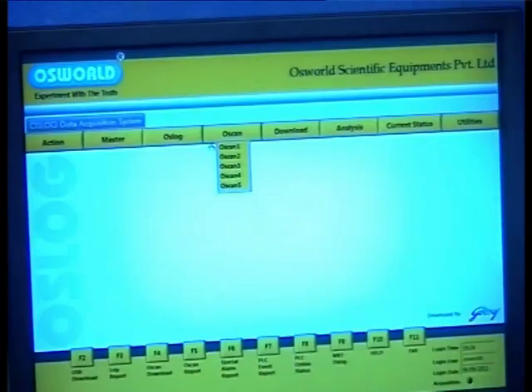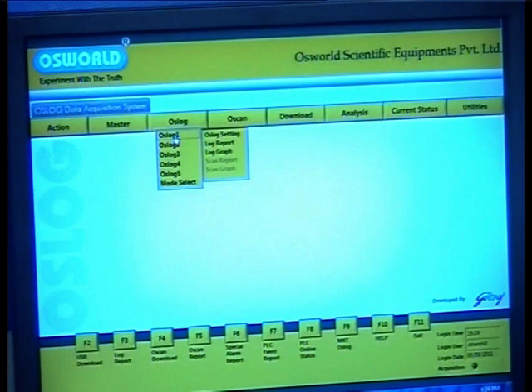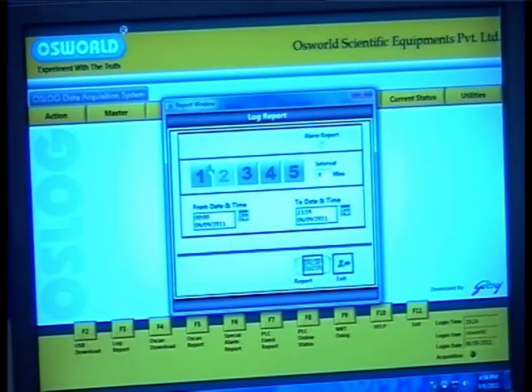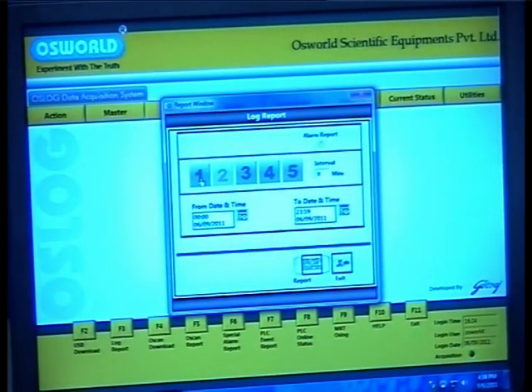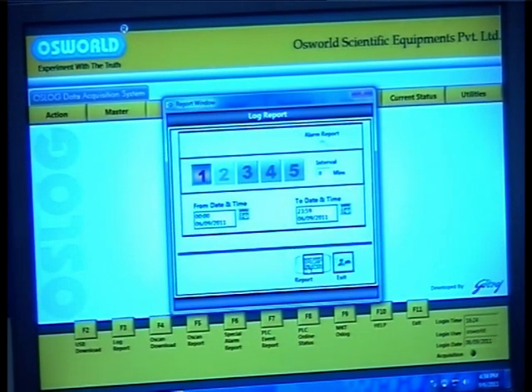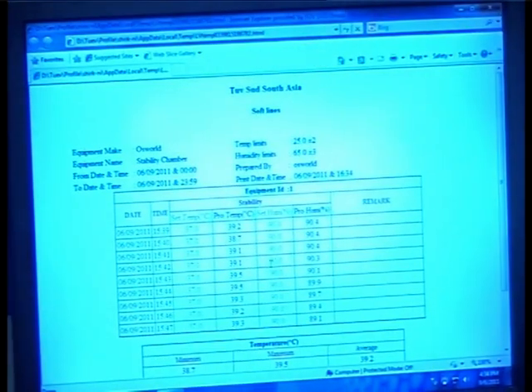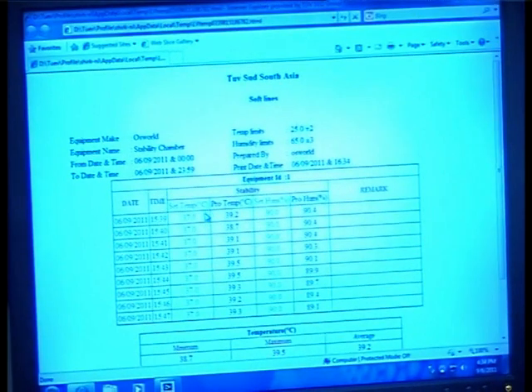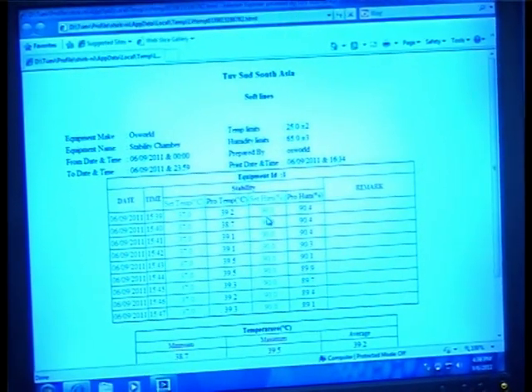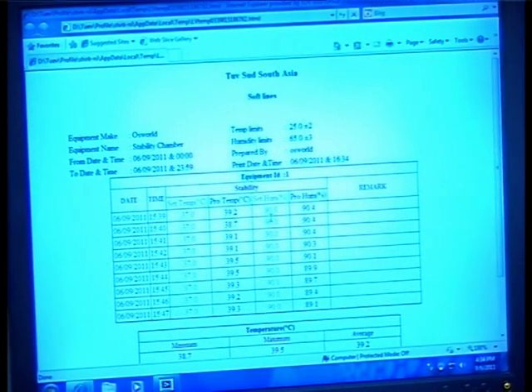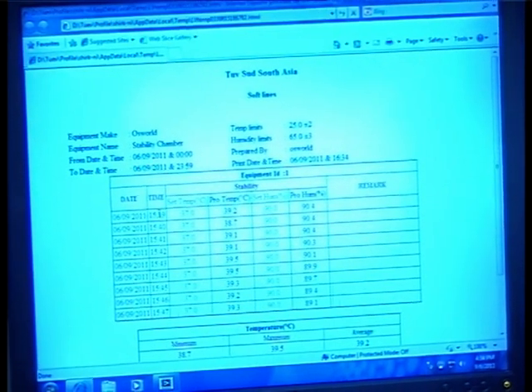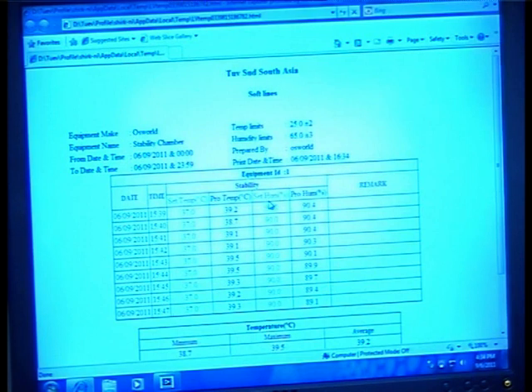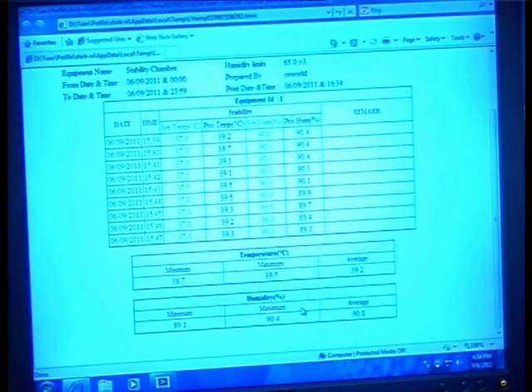Moving on to reports and graphs: data from your equipment can be recorded and viewed as numerical or graphical reports. To generate a numerical report in tabular form, go to the Oslox drop-down, select Oslox 1, and select log report. The log report window opens up. Enter the interval time you want between your readings — this could vary from 1 minute to 5 minutes to 20 minutes as per your requirement. Enter a start and end date and hit report. You will observe your data in tabular form with the date, time at your defined intervals, your set temperature and humidity, and the actual observed values. An average value of both is shown at the bottom of the table.